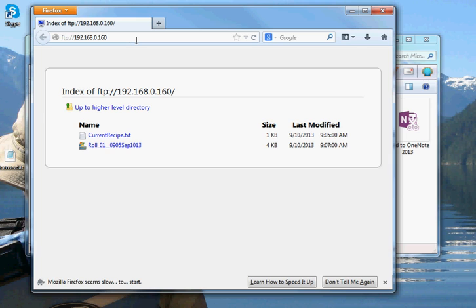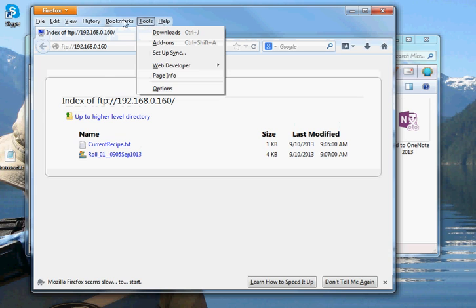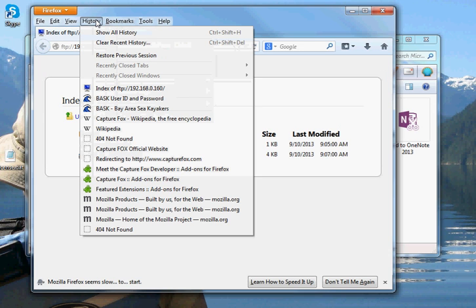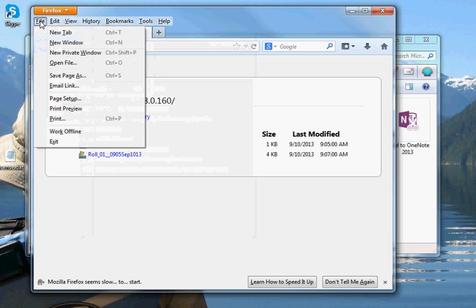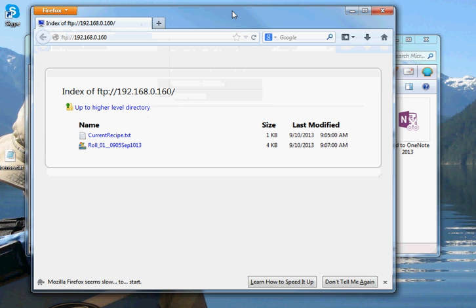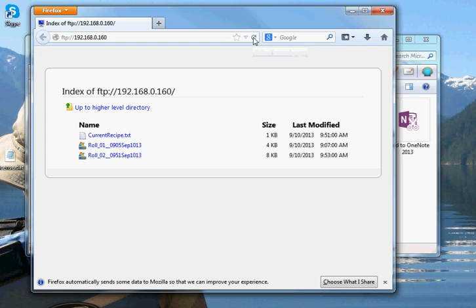I'm going to have to hit refresh here, but I don't know where refresh is. We've got to find it. Refresh, where is it? Maybe it's this. Yep, there it is.